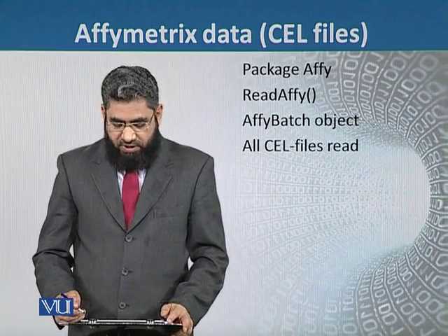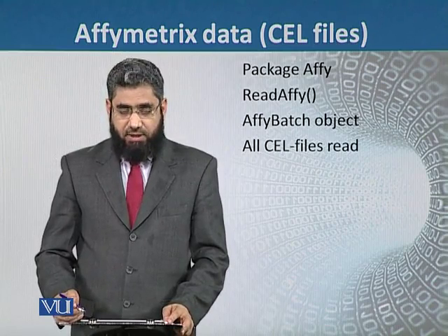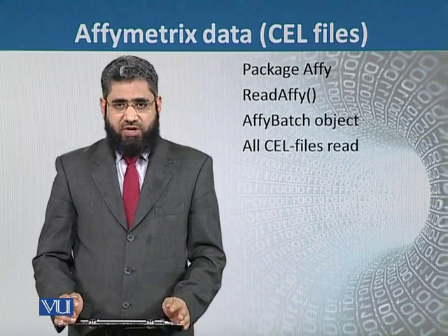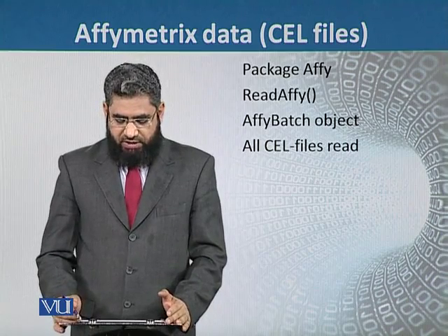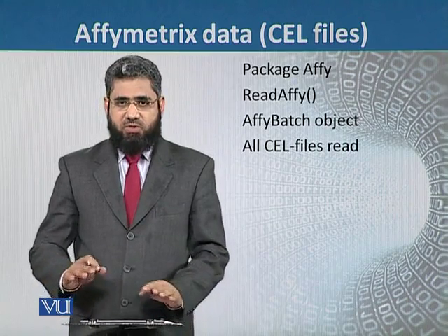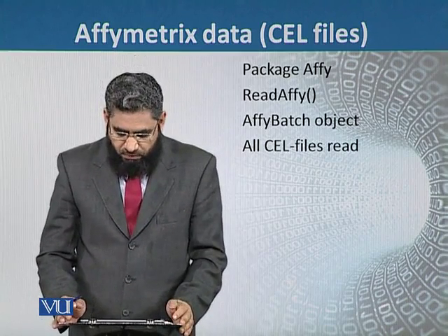We can use the command ReadAffy to analyze the files generated with the Affymetrix chipsets. These files are generated after scanning of the hybridized chips.